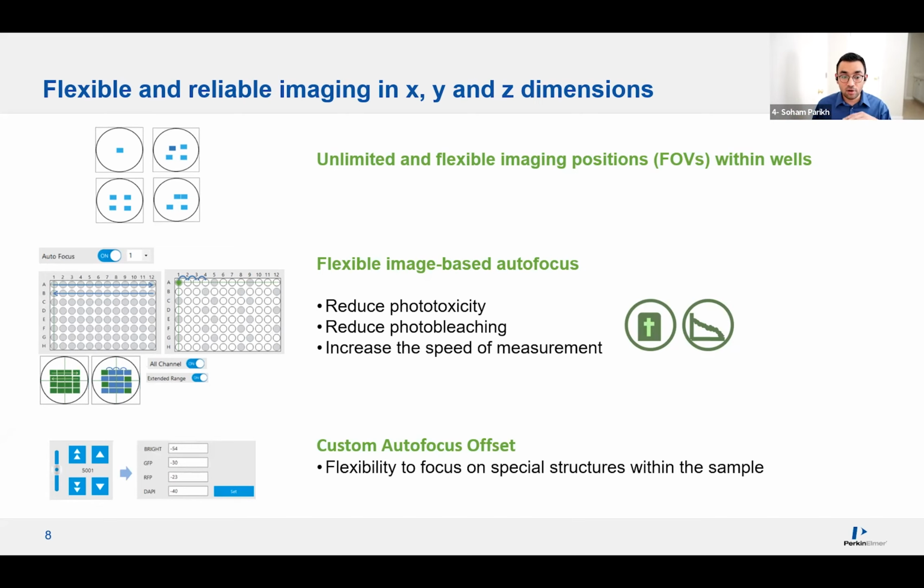So again, all of these things would be explained further in the training sessions, but just know for now that you would have a lot of flexibility in terms of how you can set up different focusing modes so that you can avoid any sort of photobleaching and phototoxicity.